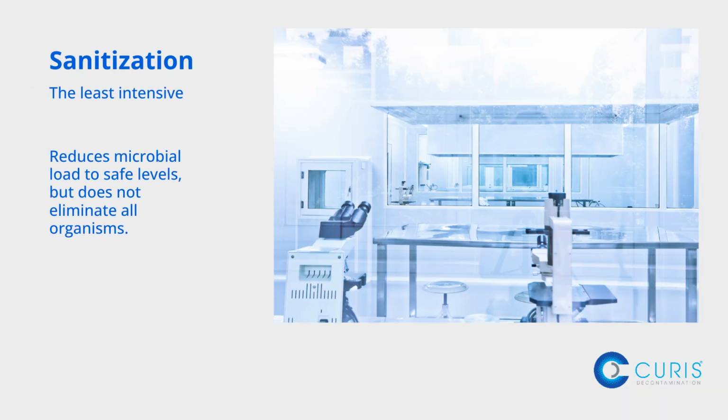Sanitization is the least intensive. It reduces microbial load to safe levels, but does not eliminate all organisms. In lower-risk settings, sanitization may be sufficient, but in high-stakes lab environments, it's critical to understand its limitations.